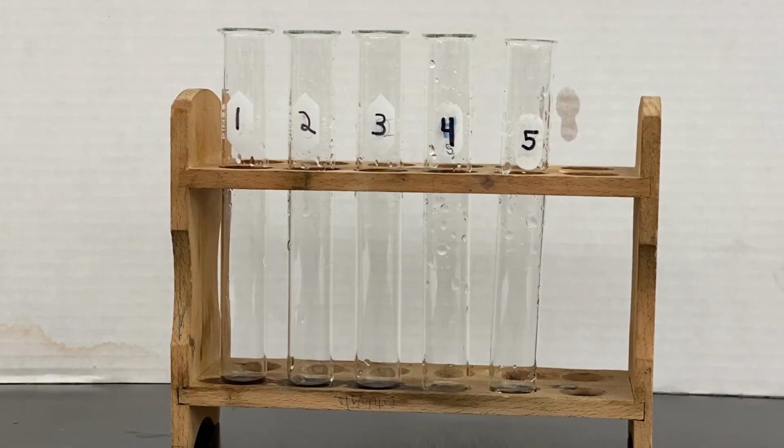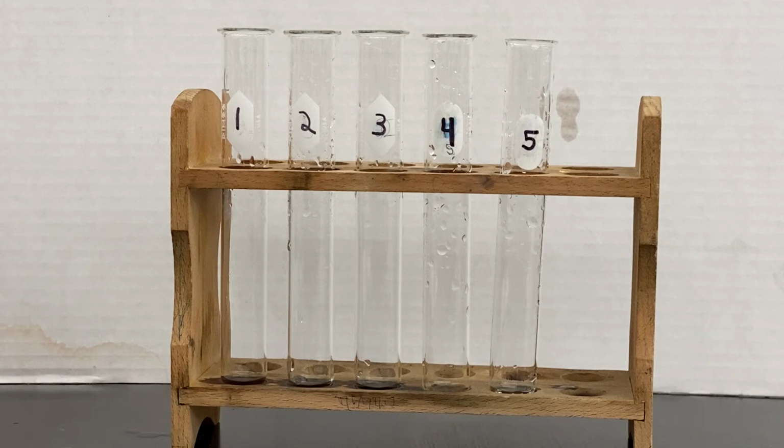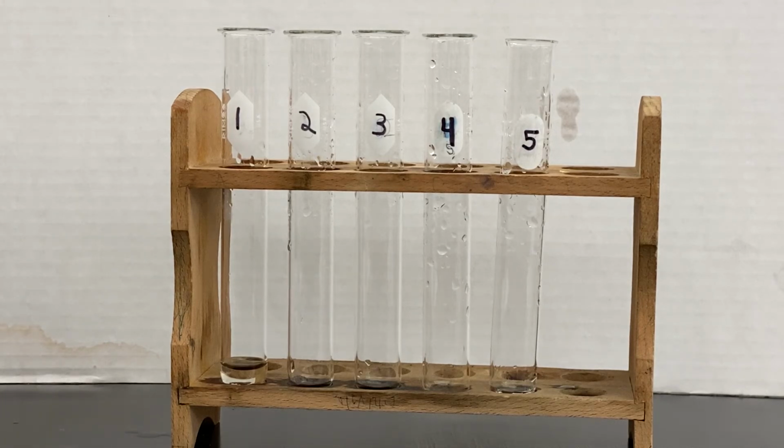So once again, we have 5 clean test tubes. Now we're going to test the 5 foods with unknown carbohydrates in them with the iodine solution. So I'm going to take my honey solution once again, and I'm going to add 20 drops of it in test tube 1. I'm going to take my liquid oats solution and add 20 drops of it to test tube 2.